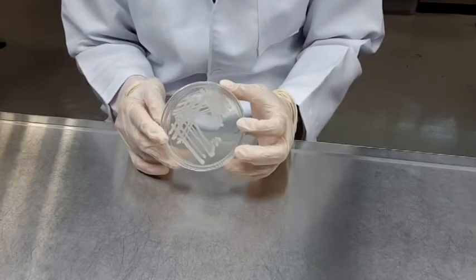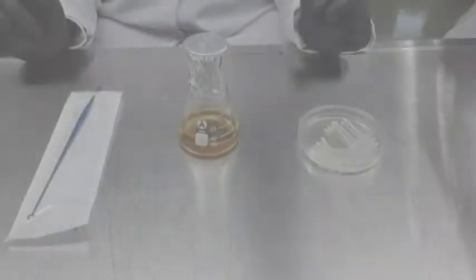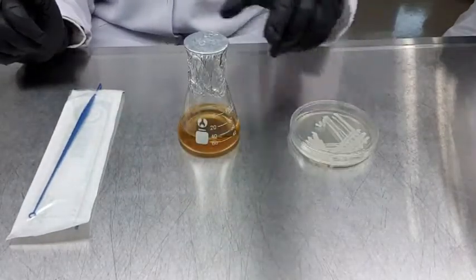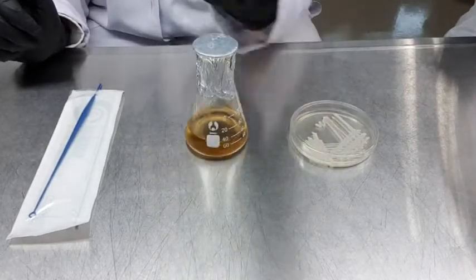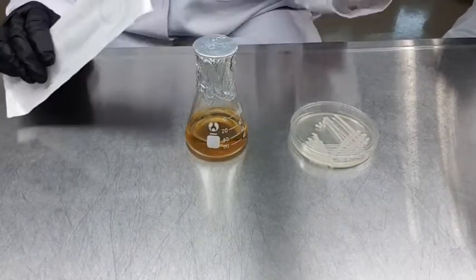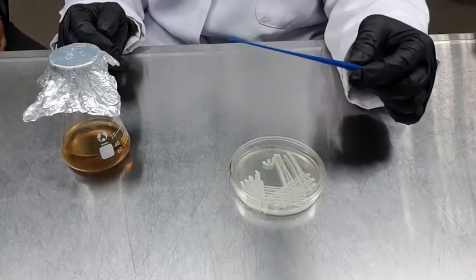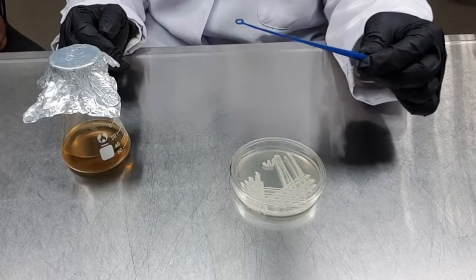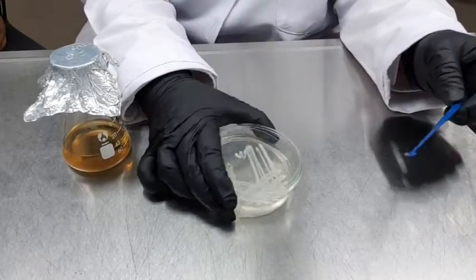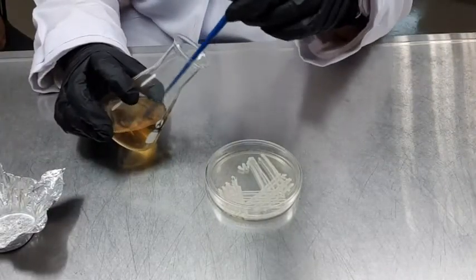We will be using the yeast Saccharomyces cerevisiae as the inoculum in this experiment. We are going to inoculate the yeast from a PDA plate into glucose liquid media by using a disposable loop. The disposable loop does not need prior sterilization and can be disposed right after usage. By using the inoculating loop, pick some of the yeast colony from the plate.